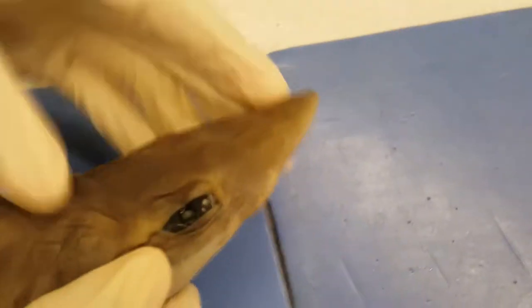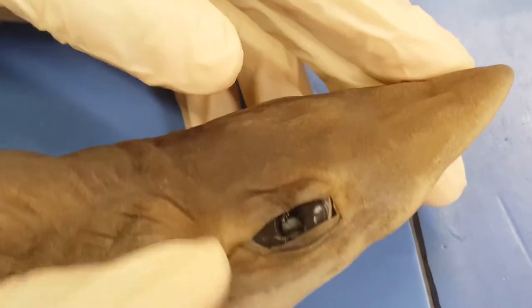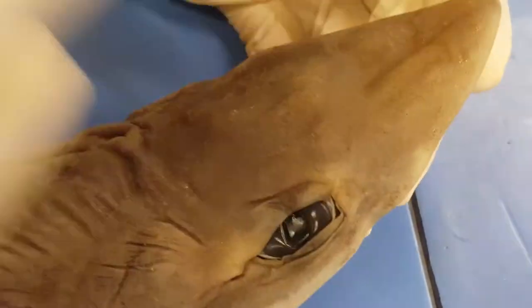After that we have the spiracles. It's this little hole above the eye. Basically it's another way of the shark breathing whenever his mouth is closed.